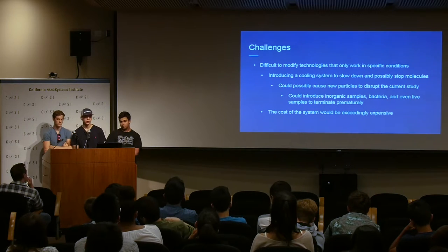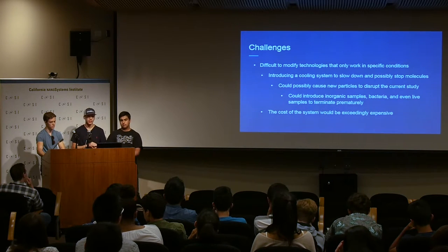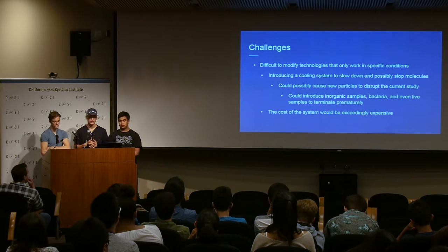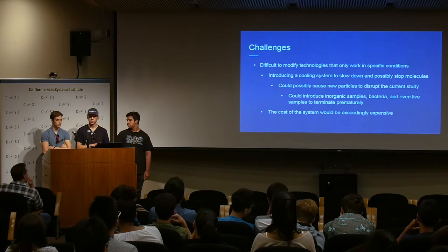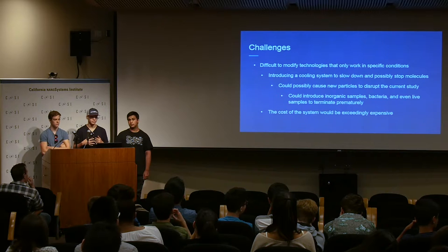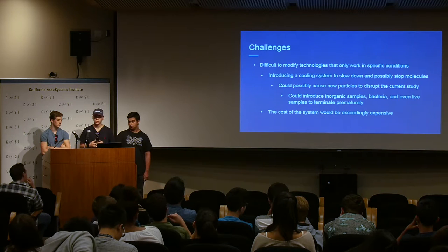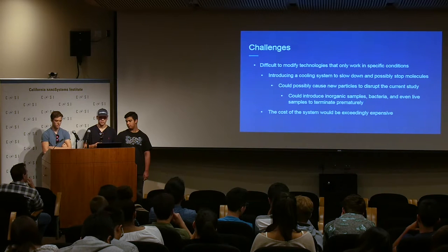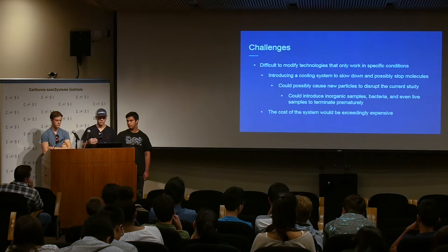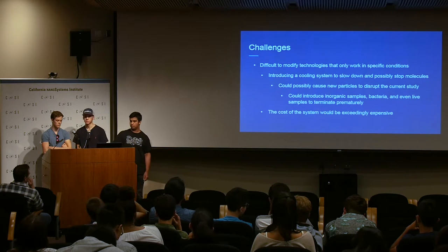Now, the challenges that we're going to face are that introducing a cooling laser is very hard in a TEM because it could introduce new particles like photons, and it could disrupt the images because you need reflection to get the image. And the cooling could also possibly damage live cells prematurely. Plus, introducing the cooling laser into the TEM is very expensive because the TEM alone is roughly $500,000 to $1 million.